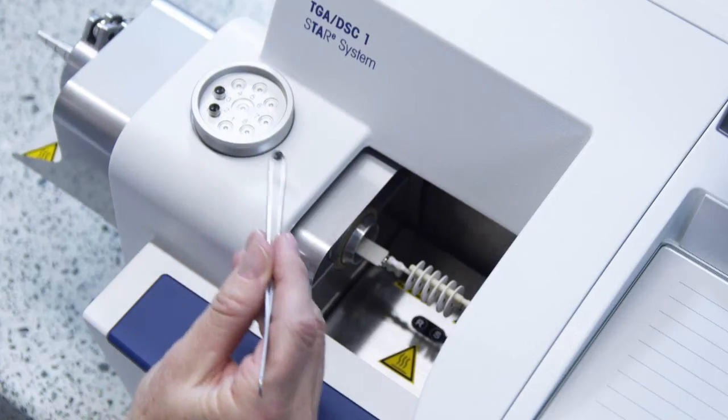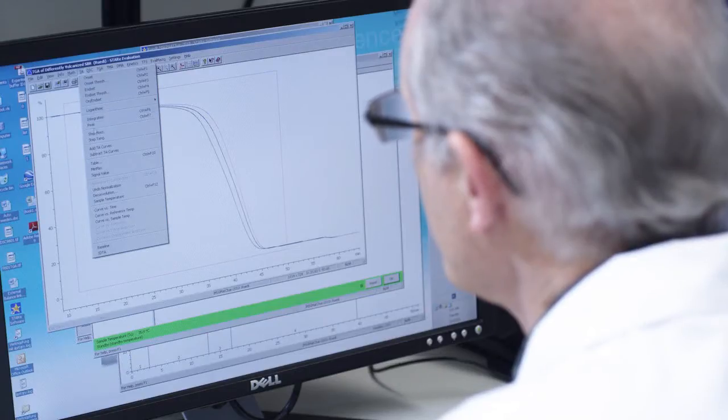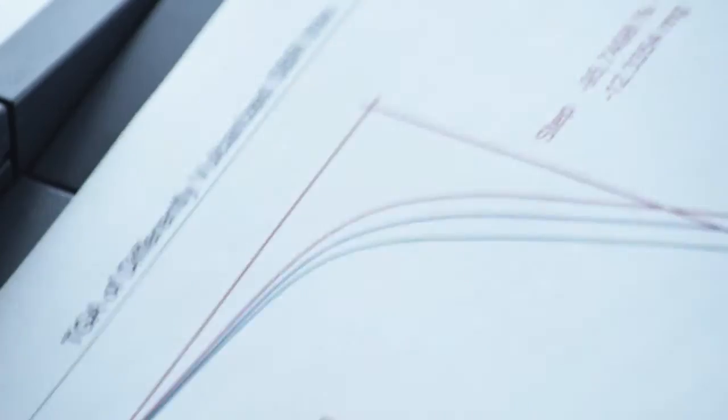The ergonomic design of the instrument and features such as SmartSense guarantee ease of use and operation, free from mechanical disturbances. The powerful STAR software provides unrivalled flexibility and almost unlimited evaluation possibilities.